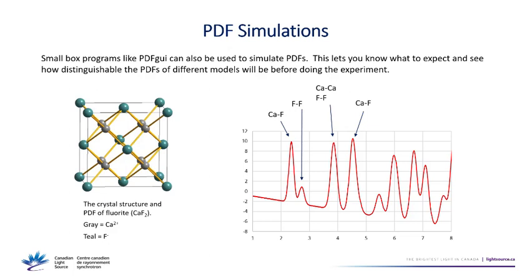Just a question on top of that. In theory, could you use a much lower energy and much larger wavelength to, instead of determining the parameters of the crystal structure, determine the parameters of the individual particles? Like if all the particles were exactly the same, they were all rods, could you use a longer wavelength to determine the length of the rod and the diameter and things like that? Yeah, the particle shapes? Yeah.